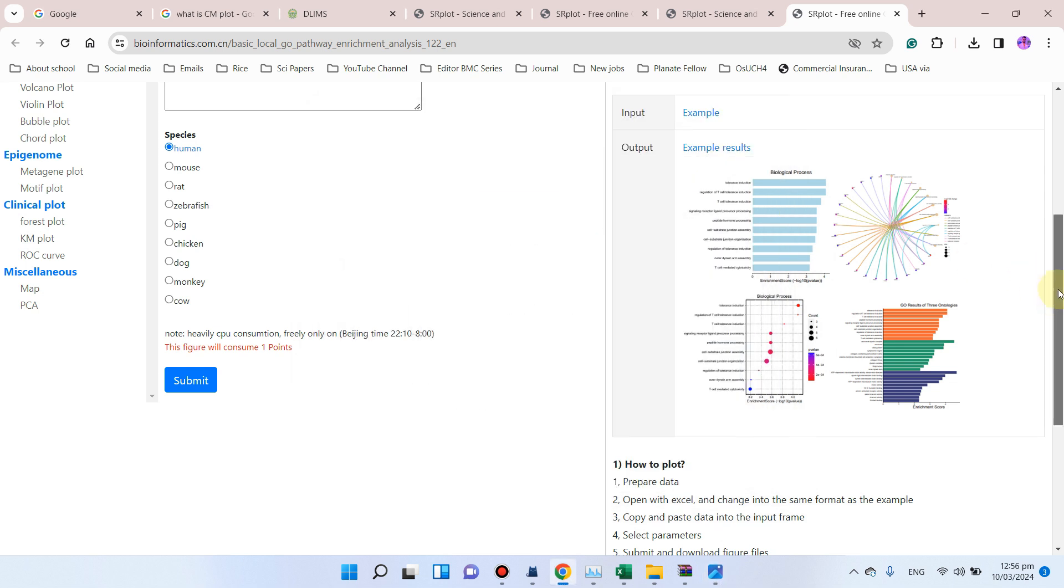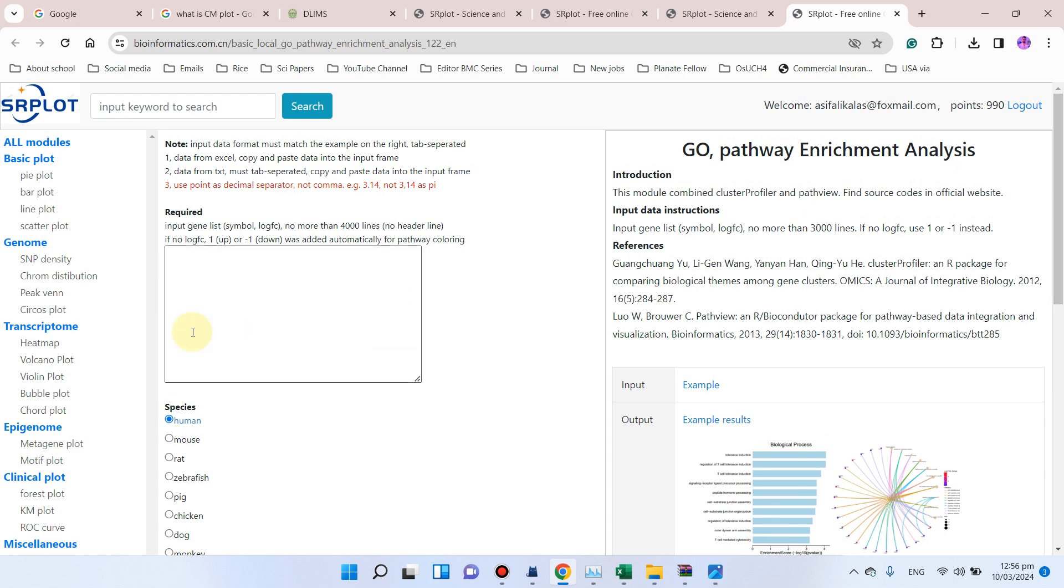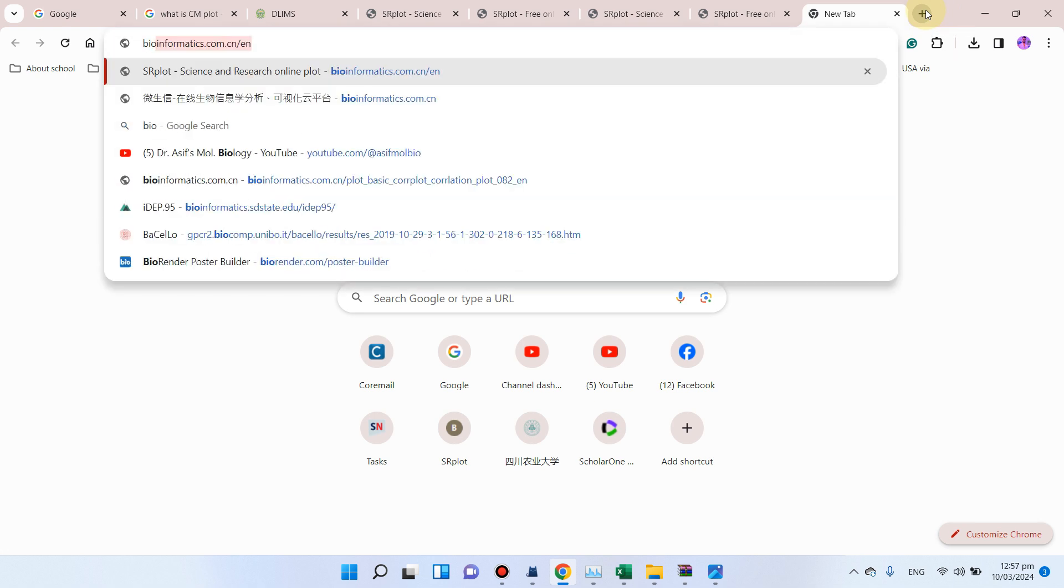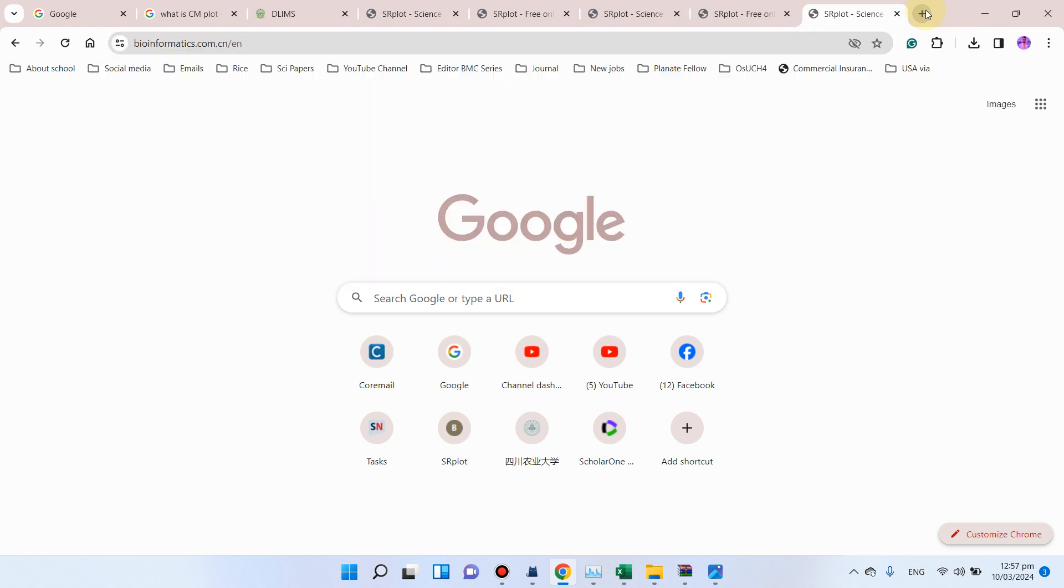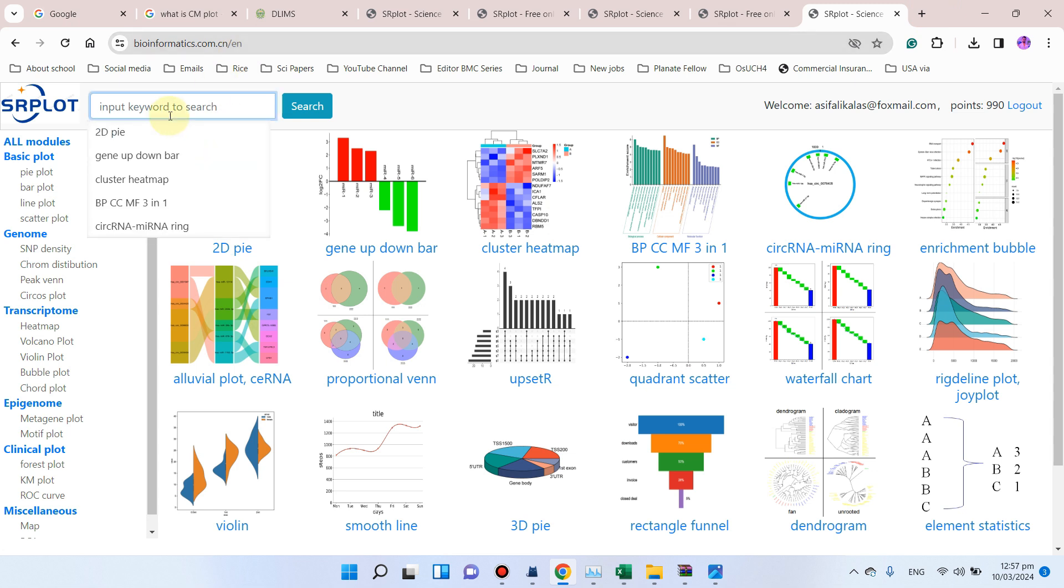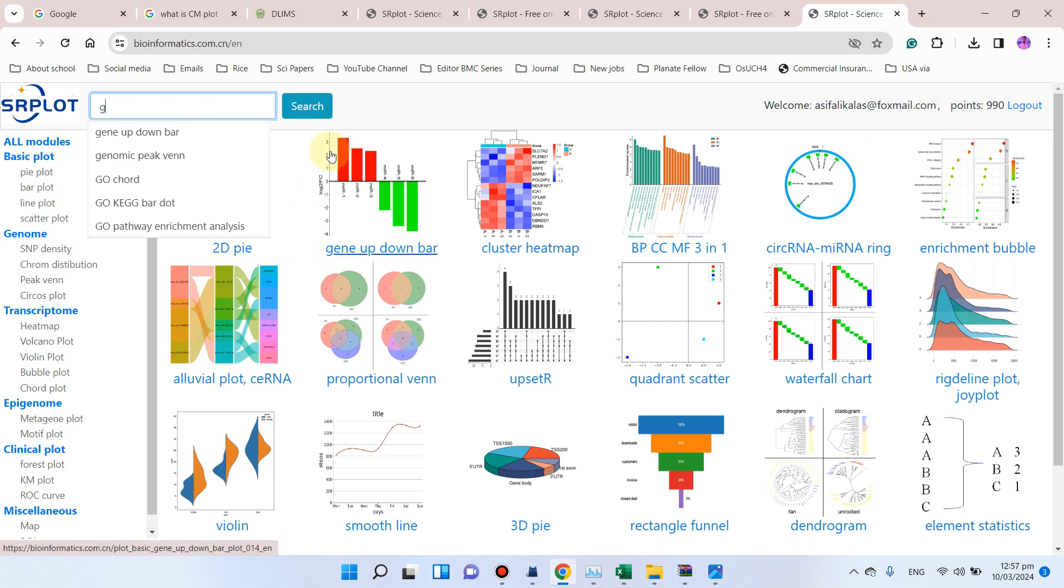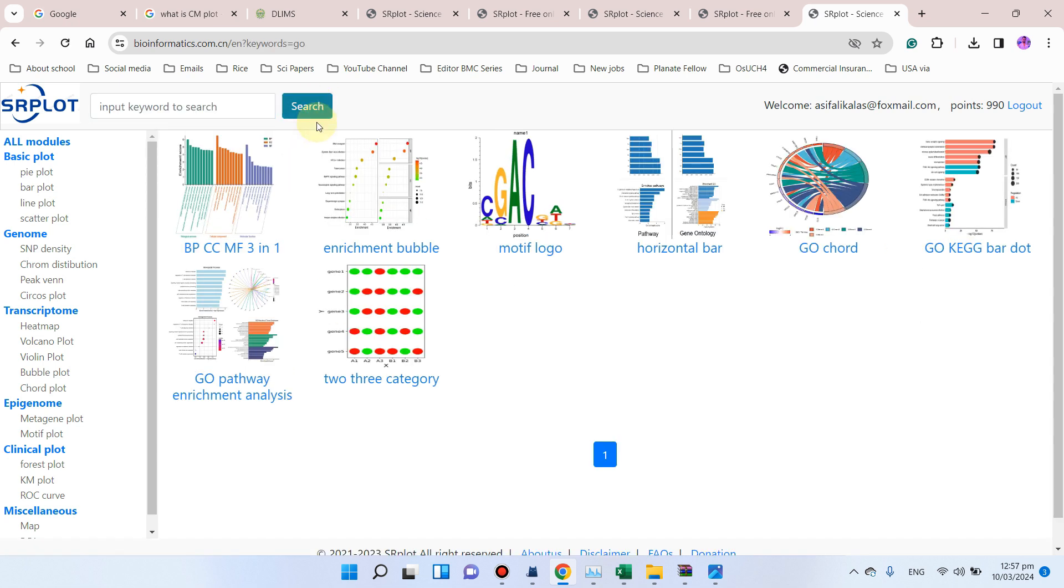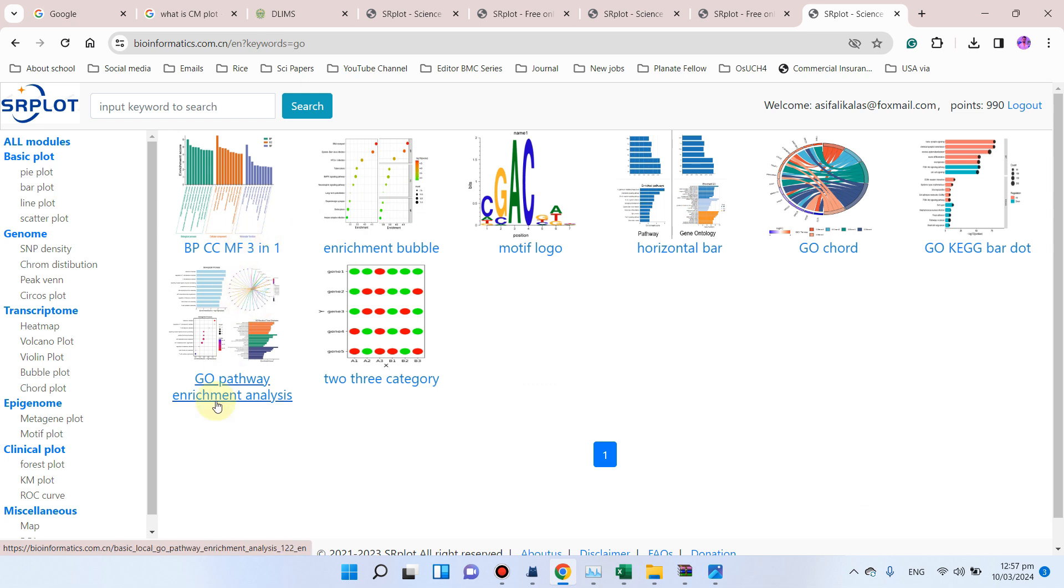So what you need to do: you just need to simply go to this SRplot website, which is bioinformatics.com.cn/en for English version. So you need to make sure first you are logging in.